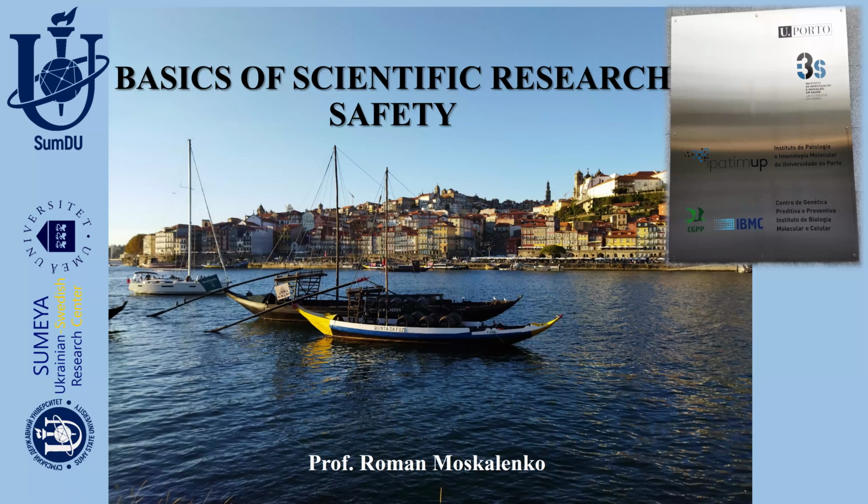Hello, dear students. Today we will talk about general safety rules in lab and scientific research.